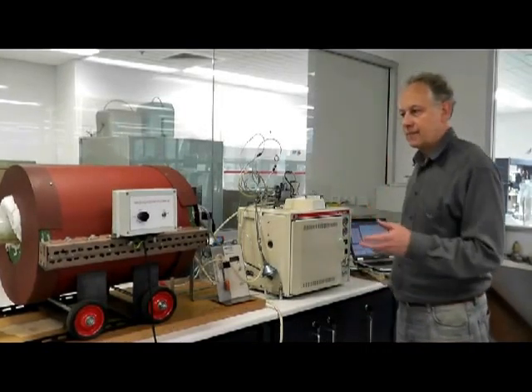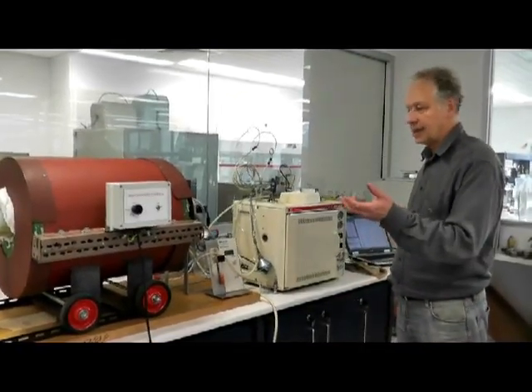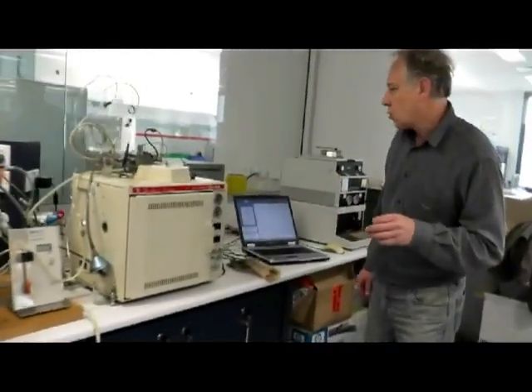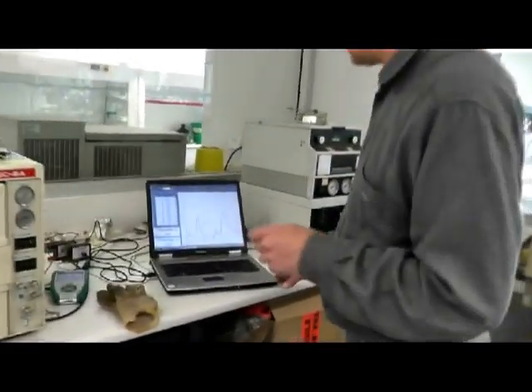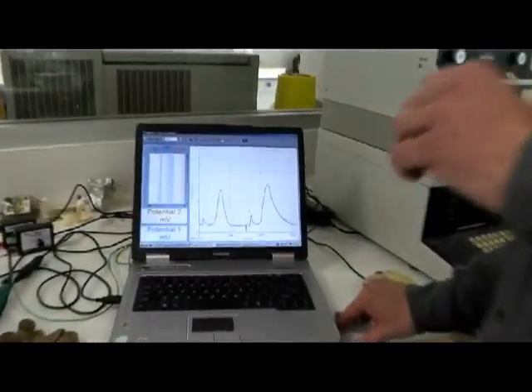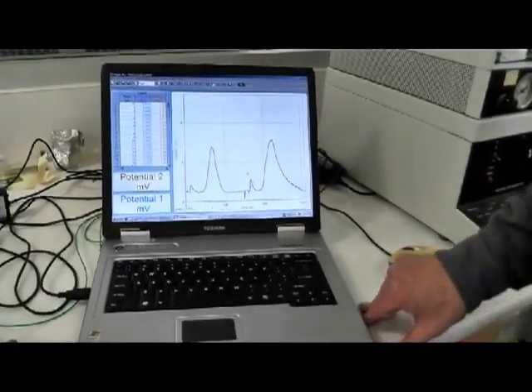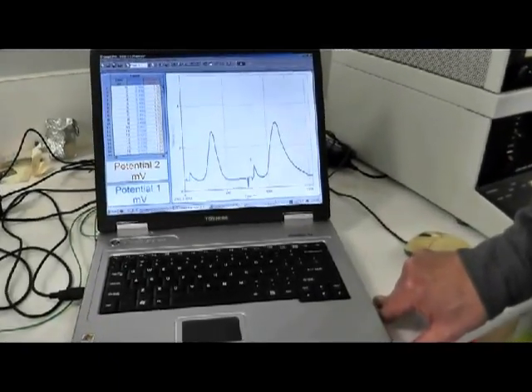Carbon is extracted from the organic matter in the core and carried through in the gas stream to the detection system where the signal is recorded on the data system. And the amount of signal we get or the area of the peak is proportional to the amount of carbon in the core.